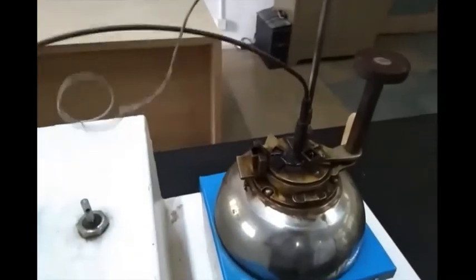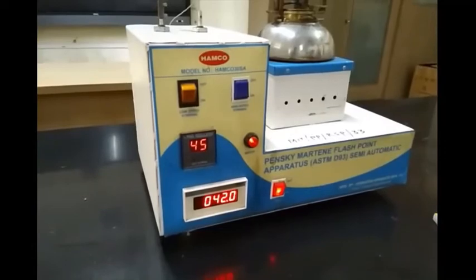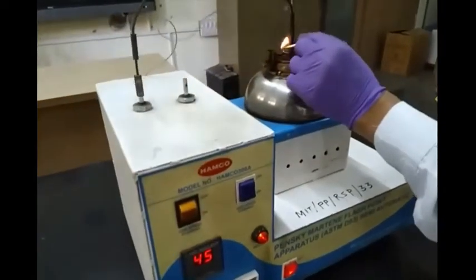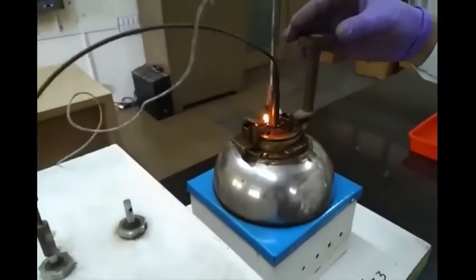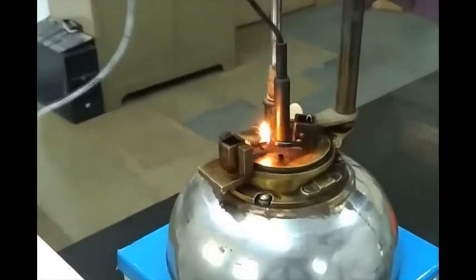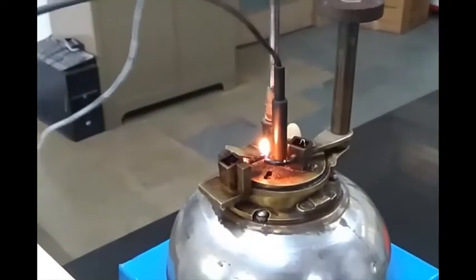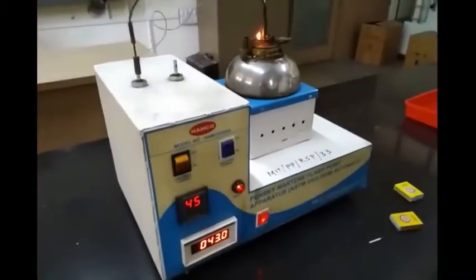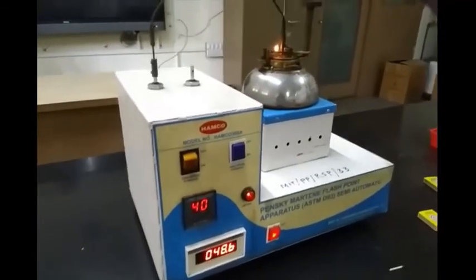We allow the temperature to rise and then we check for the flashpoint after certain intervals of time. Now temperature is 42 degrees Celsius and we test the flashpoint. First, we ignite the test lamp and then drop this flame inside the cup to check the flash. We haven't seen any flash in this case, so this is not the flashpoint.